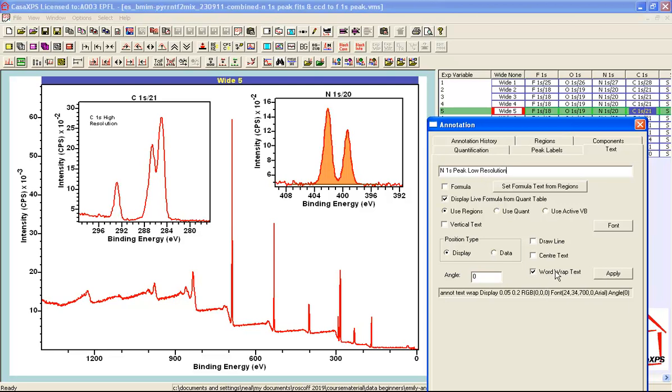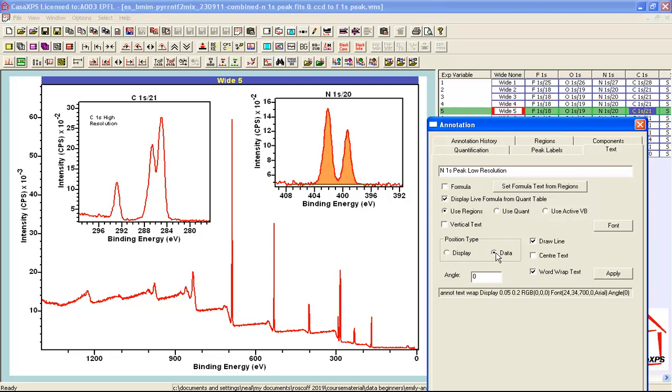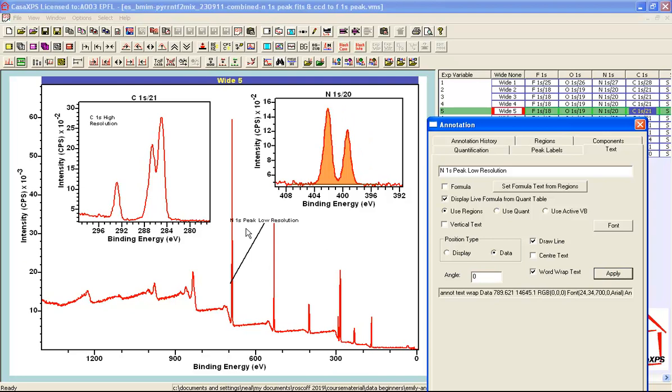I've got word wrap and I also would like to draw a line associated with the word wrap text. I'm going to associate this text with a particular peak in this survey spectrum. So rather than having the display position for the annotation I'm going to select data. So this means that all the positions that are used to define the annotation position will now be relative to the intensity and also the energy. So when I press apply I end up with text and a line.